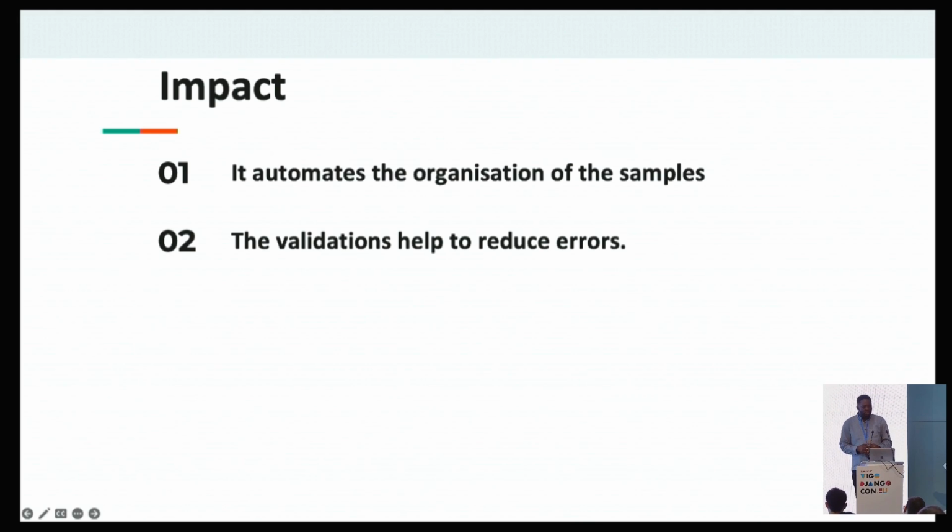The other issue we're able to fix is human error, where maybe your sample is a repeat sample, and it's already in our system, because each sample needs to be unique. So we check our system as we're importing the data. We use a Django GET request to check if this particular lab sample ID exists in the database already. So that's another way we're able to reduce error, to be sure that each sample we are importing into our system is actually a unique sample.